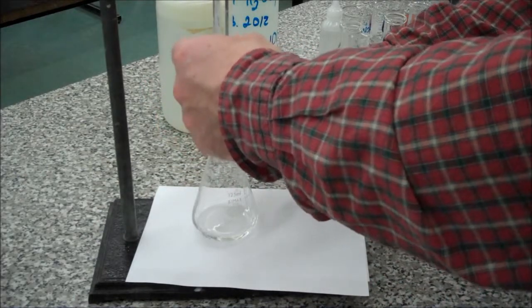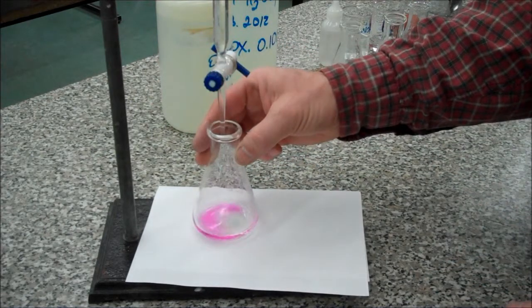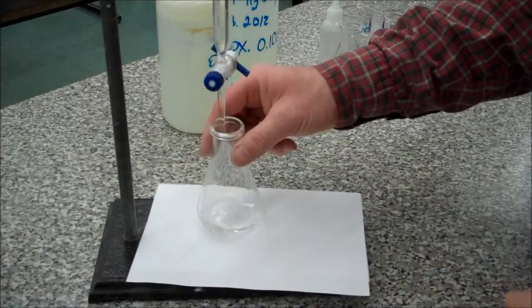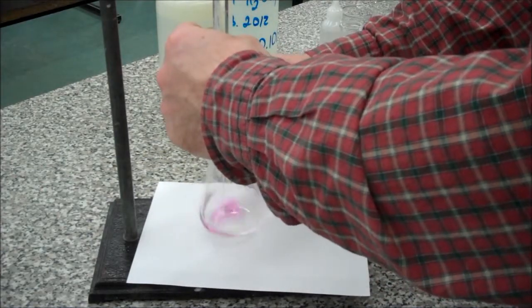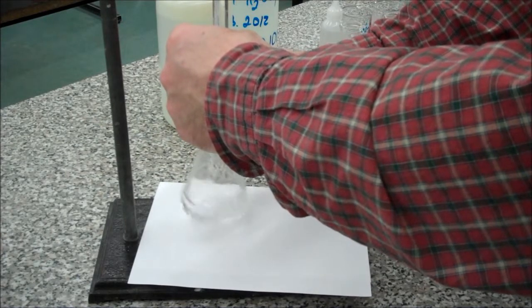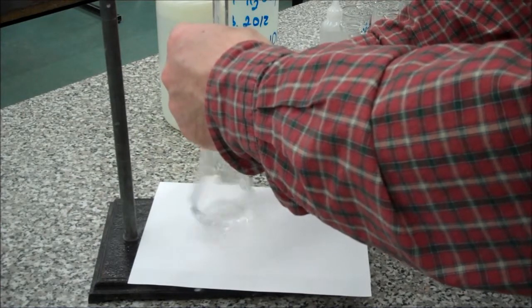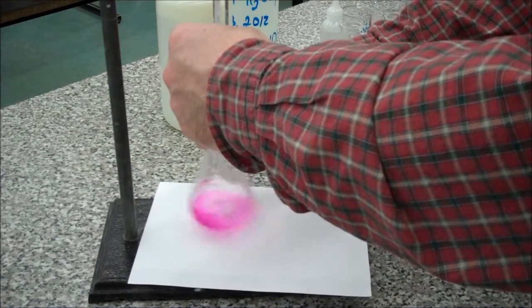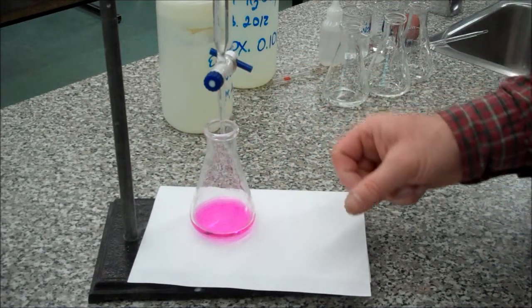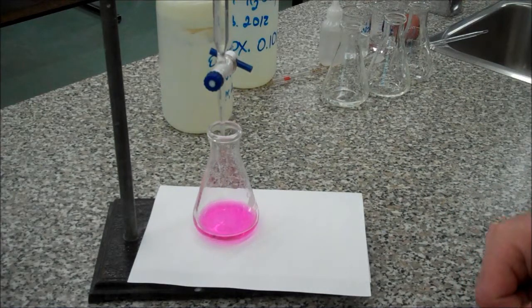Okay, so here I go. I'll just not swirl it for a second so you can see what will happen. See the pink color? That pink color is the indicator changing color. And so that when I get to the end, that pink color will stay. So swirling the entire time, we'll add some of the base. This is our known. And notice that it does disappear. When the pink color starts to persist, then you want to slow down. That's sort of persisting right there. And so I'm just going to add drop-wise, so slowly. Whoops, that's it. I overshot it a little bit. I think I'm probably 2 drops out. Anyways, so that's the end point. That's what you're looking for. You can get it within a drop if you're really careful.